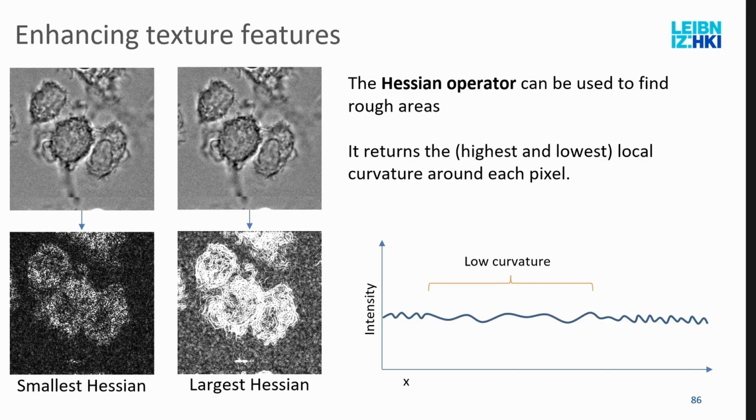So the fluorescence data, if you remember, I showed it very shortly in the beginning. There was a red channel, and there were supposed to be the macrophages, but it was not really working. So they only had the transmitted light images, and to really get the macrophages out.